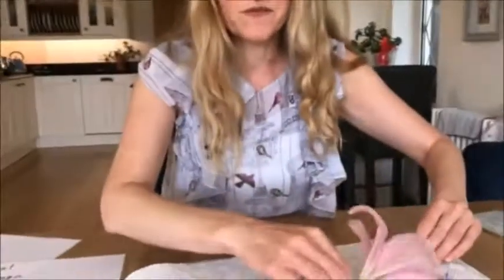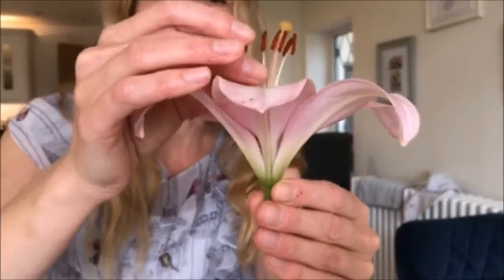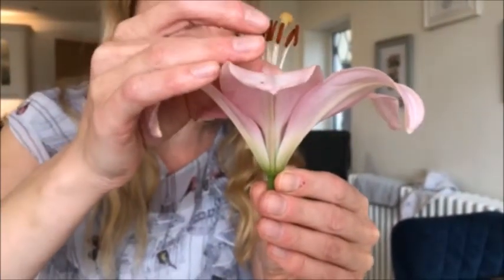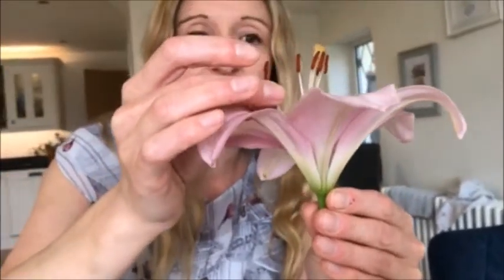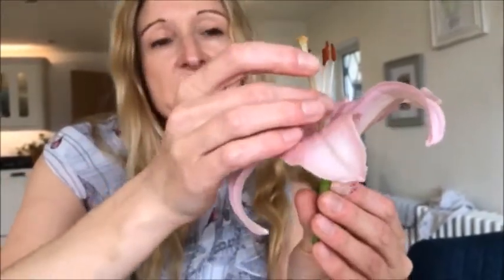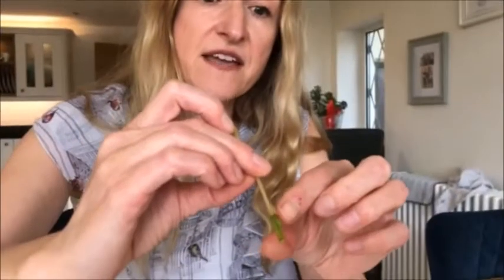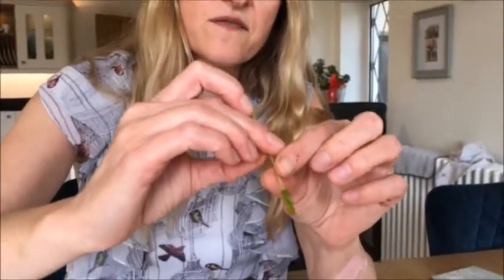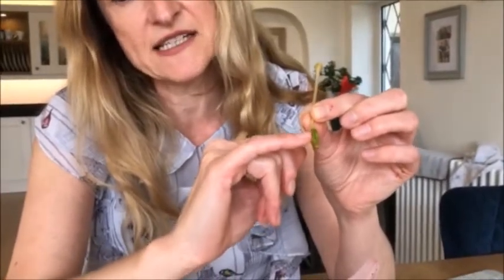Okay, so just to recap, petal for the insects to land on, anther produces the pollen, filament is what holds the anther up and accessible to the bees, stigma, part of the female reproductive system in the plant, style, going down to ovary, female part of the reproductive system with the ovules all inside.